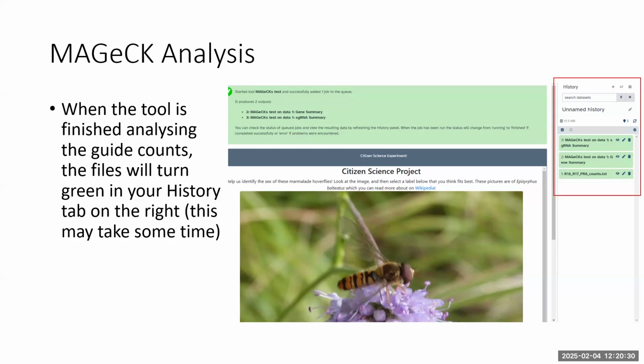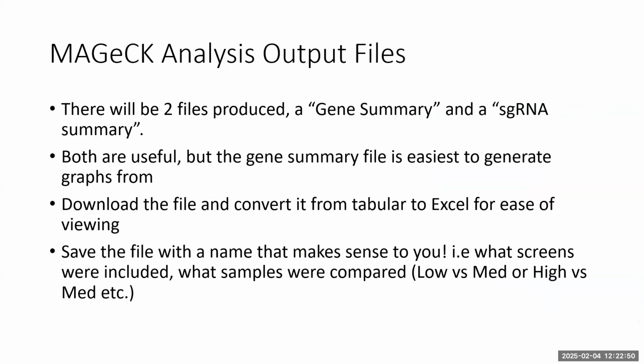You can download it by just clicking on the box. And then if you scroll down, there's a little disk icon. We don't use those anymore. Then that'll download it as a text file, and you can just open that in Excel. Are you guys able to open that in Excel right away? I think you can open it as a text file. Then if you save that, has anyone been able to download that and open it in Excel? For some reason I'm having difficulty doing it.